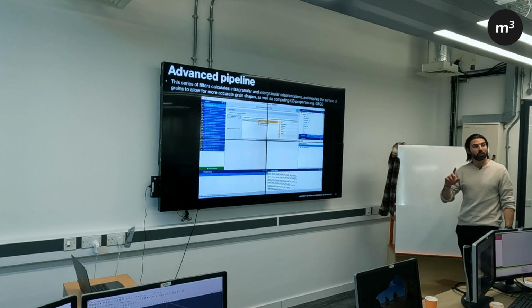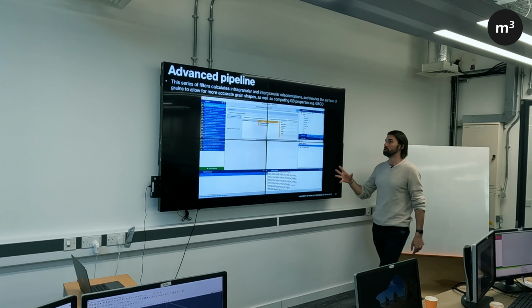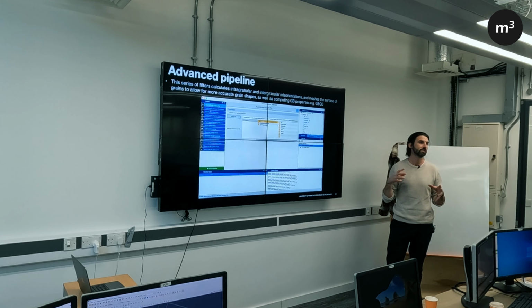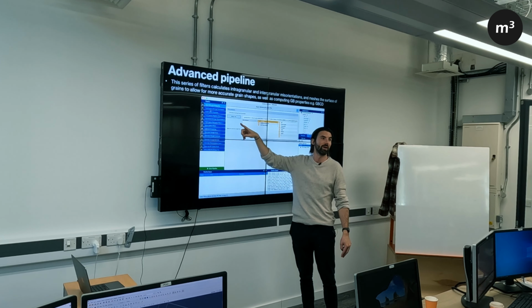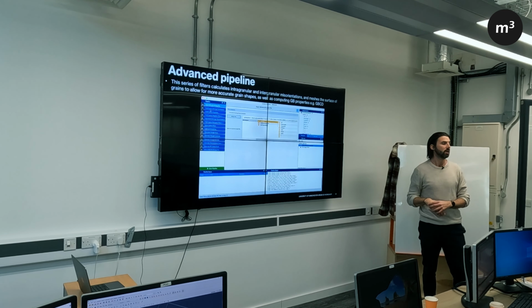So again, this is a really good thing about doing 3D. Once you've got a nice data set you're happy with, obviously you don't have to run through that basic pipeline every time. That's a really important thing to note, that once you've got a Dream 3D file which you're happy with in terms of the 3D data and the general alignment and cleaning of it, that's then there, and you can then read that in as many times as you want, do more and more filters on it and write that out. So you don't have to repeat that basic pipeline as long as you're happy with it.